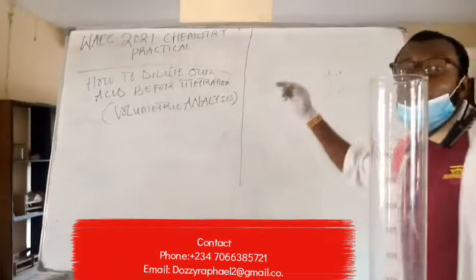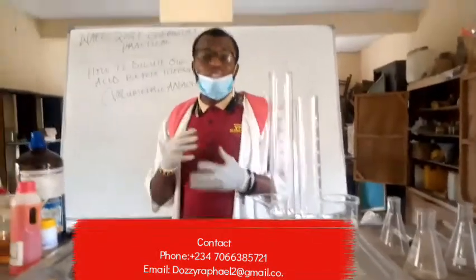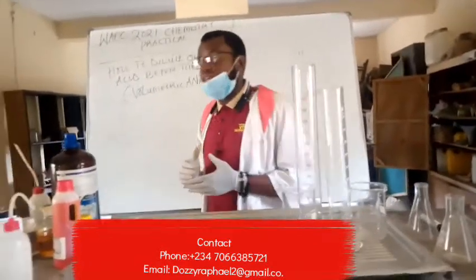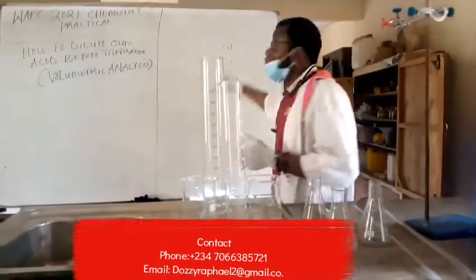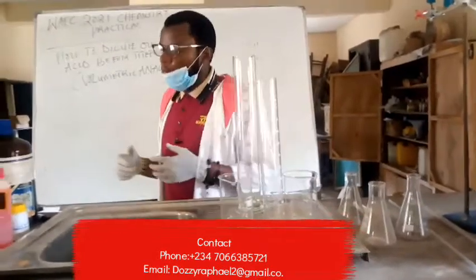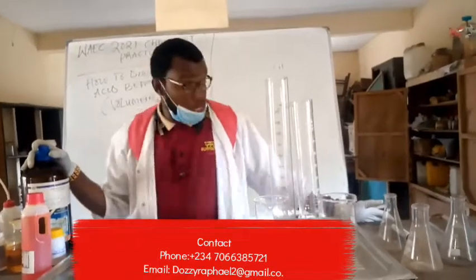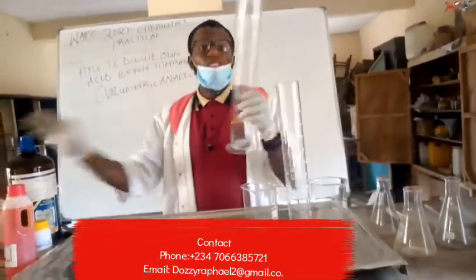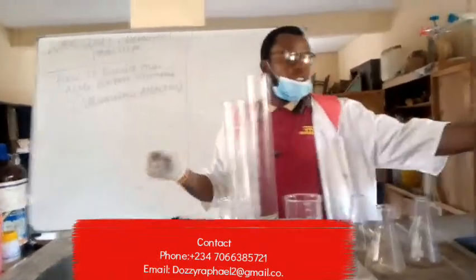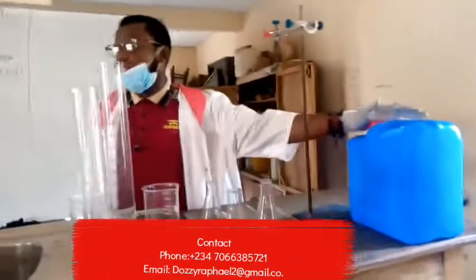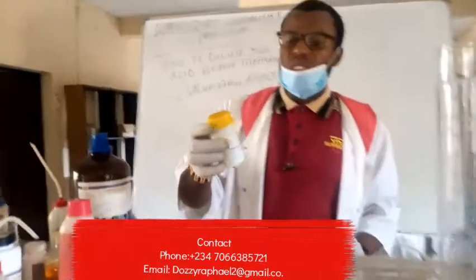A is our acid. We need to prepare this acid so that you can use it for volumetric analysis — that is, titration. In a subsequent class, we'll look at how to dilute our base, which is sodium hydroxide. But today I'll be looking at how to dilute our acid. This is my HCl and measuring cylinder — 1000 ml and 500 ml. This is our distilled water.